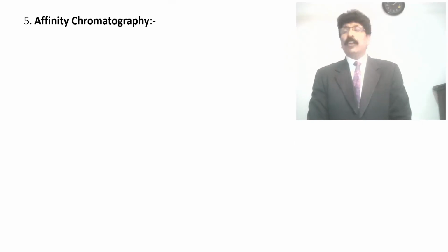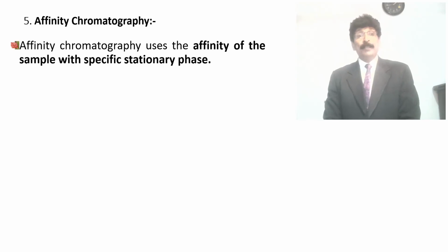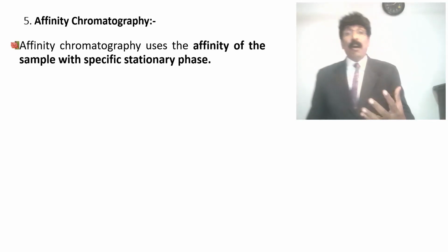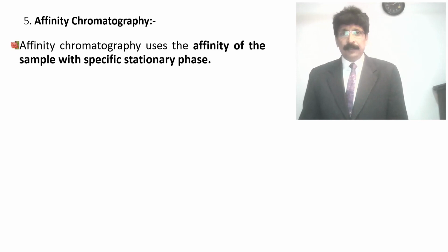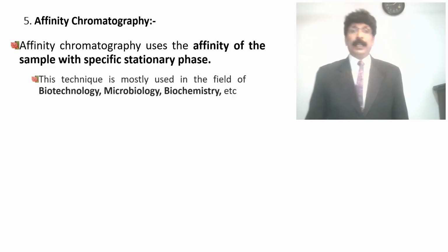Affinity chromatography, which as I said earlier, has more application in biochemistry, microbiology, biotechnology. Affinity chromatography uses the affinity of the sample, the requirement of the sample, the attachment of the sample, with a specific stationary phase that will be selected.